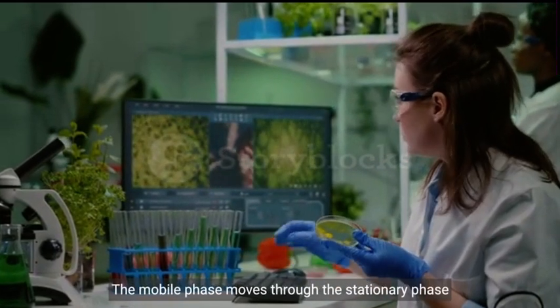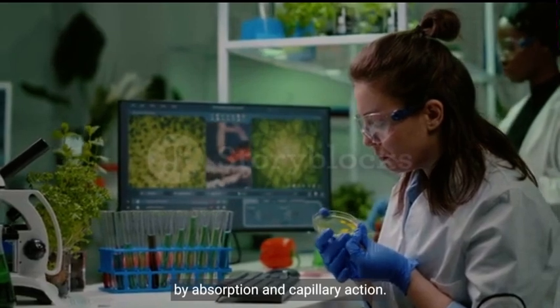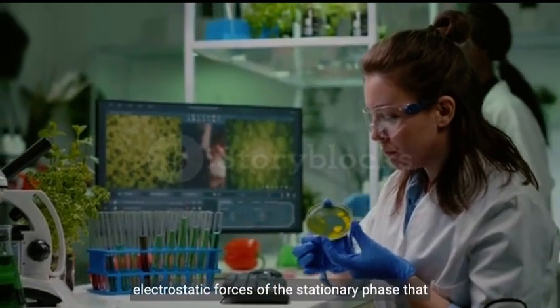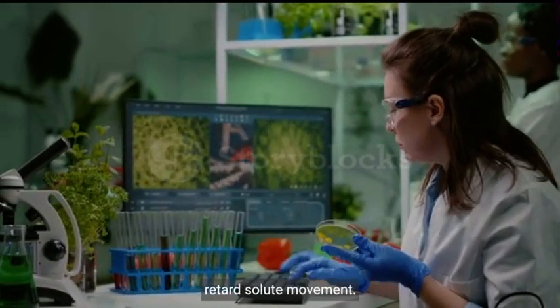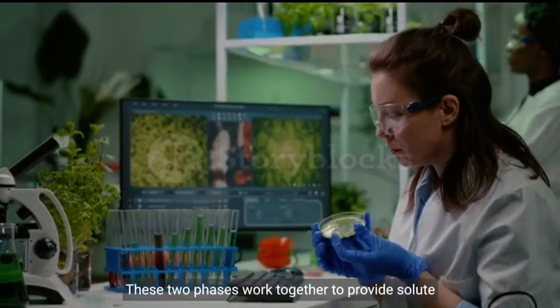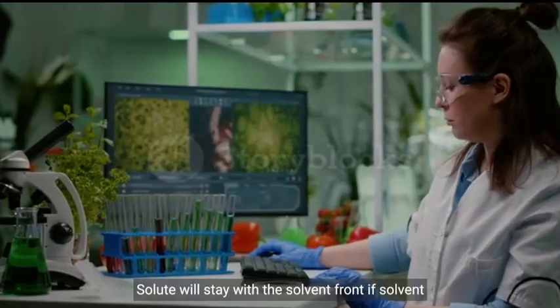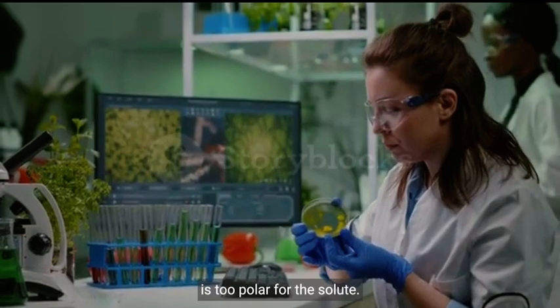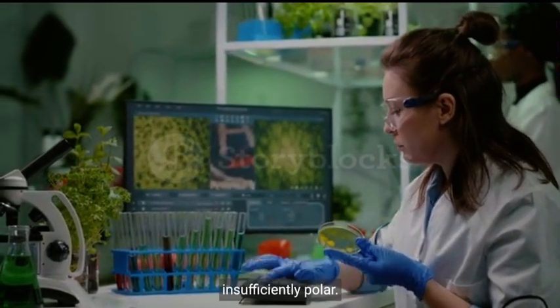The mobile phase moves through the stationary phase by absorption and capillary action. The solute components move at different rates because of solubility in the mobile phase and electrostatic forces of the stationary phase that retard solute movement. These two phases work together to provide solute resolution and separation. Solute will stay with the solvent front if solvent is too polar for the solute. Solute will remain at origin if solvent is insufficiently polar.